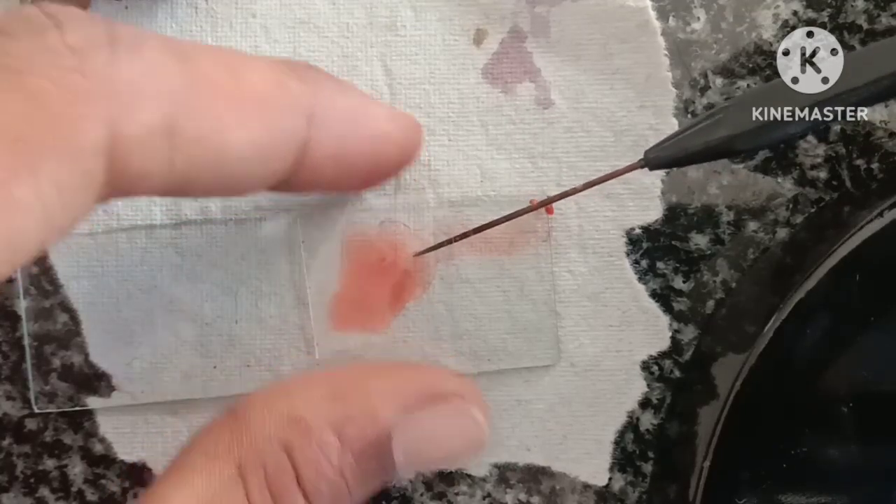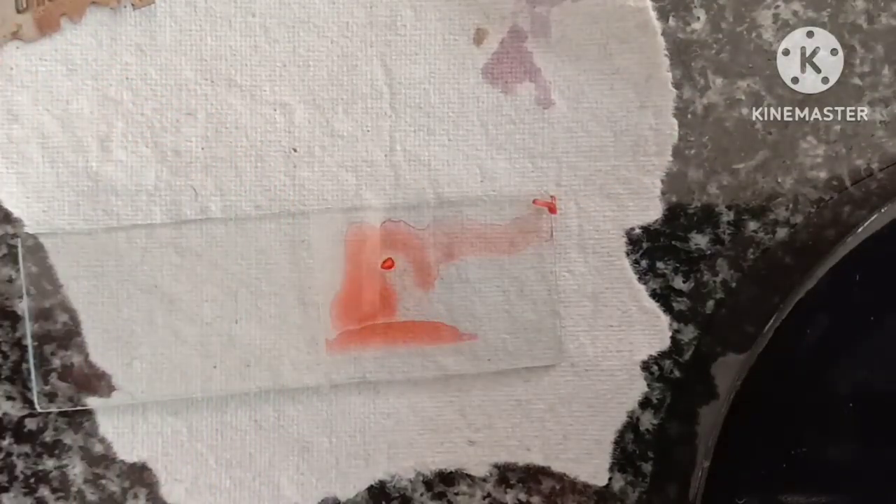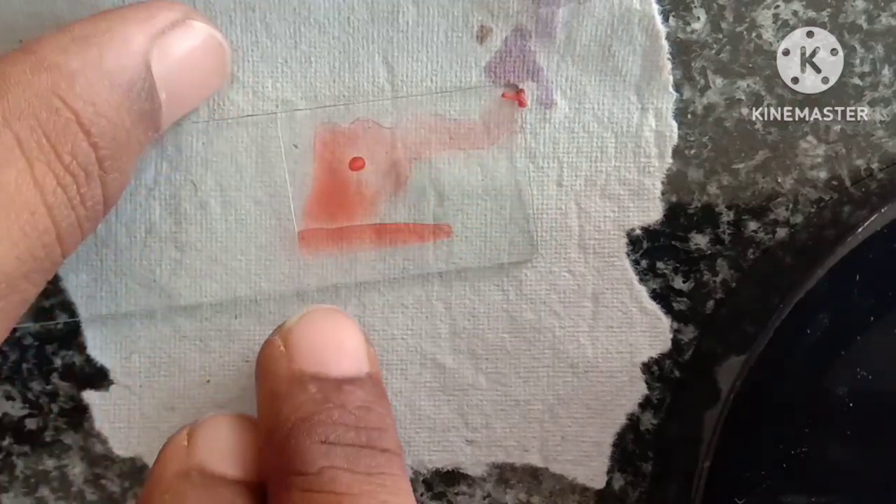Now cover it with a cover slip, like this. Then place the blotting paper on top of the cover slip tightly.